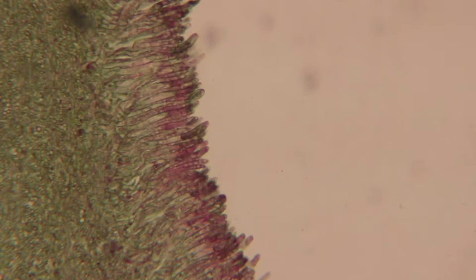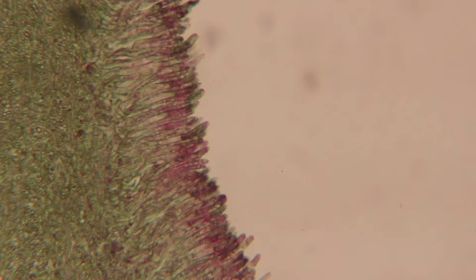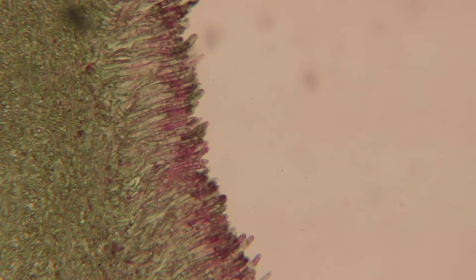We can start seeing all those little fingers. Each of those fingers is called an ascus. An ascus, when it is mature, is going to have eight spores inside. The spores are called ascus spores.